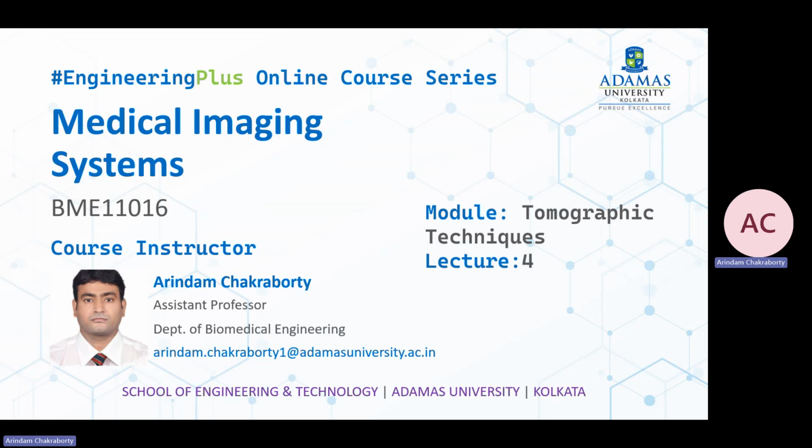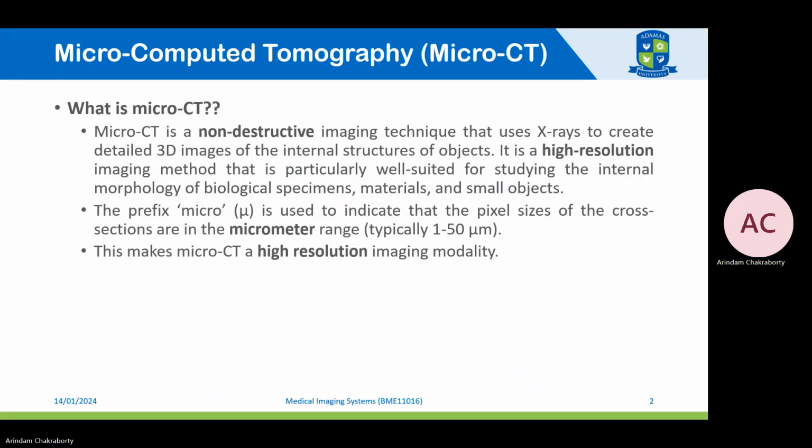a very important improvement of tomographic technique that is known as microcomputed tomography, or in short form, micro CT. To understand micro CT, we need to understand why this tomographic technique is very popular and why understanding the concept of micro CT is very important.